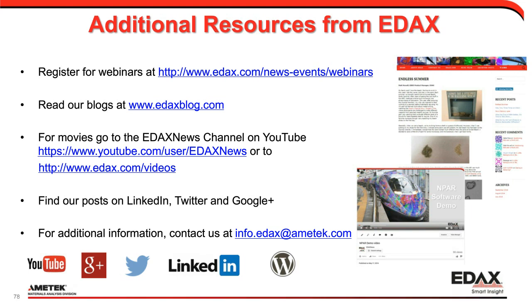A lot of this material, I don't think we planned on it. It's just kind of in there. And when you find a workflow that really works and gives good data for you, just jump on it and go for it. So with that, I'm going to go ahead and close this up.